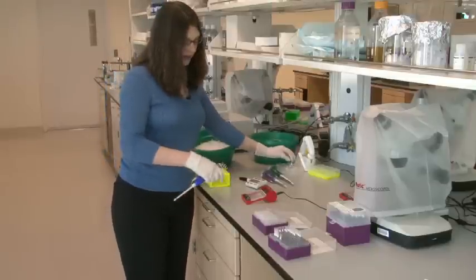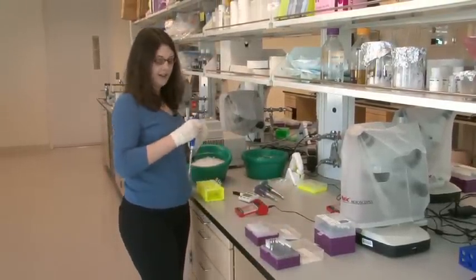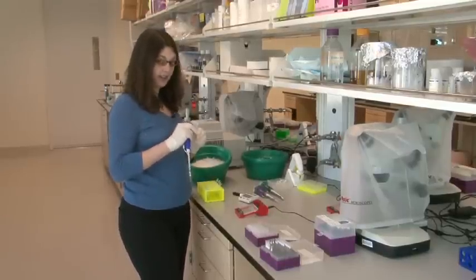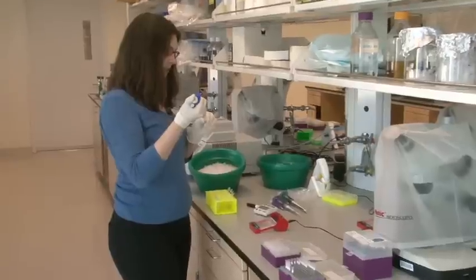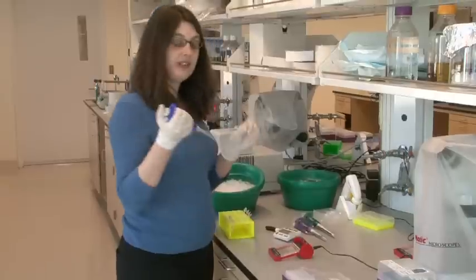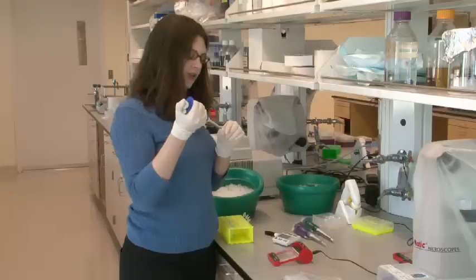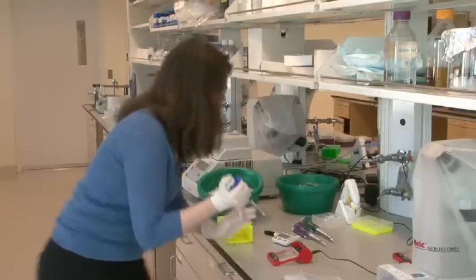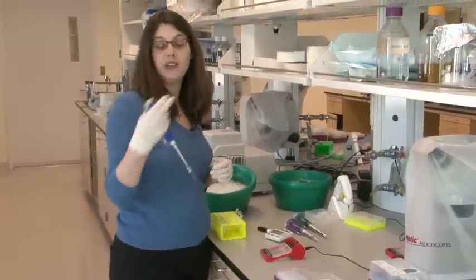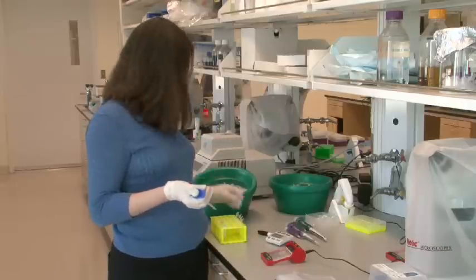And once I've loaded all the DNA samples, I'm actually going to load one other special sample. First, I'm going to add a little orange dye to it. This special sample is not the DNA from a person, but rather it's a mixture of samples of DNA that we buy from a company. And the different pieces of DNA in this mixture are pieces of DNA whose sizes we know. And so we use it like a ruler or a standard to be able to tell the lengths of the pieces of DNA that we don't know in the samples from the people. So this will be our ruler or standard, and we call it ladder.